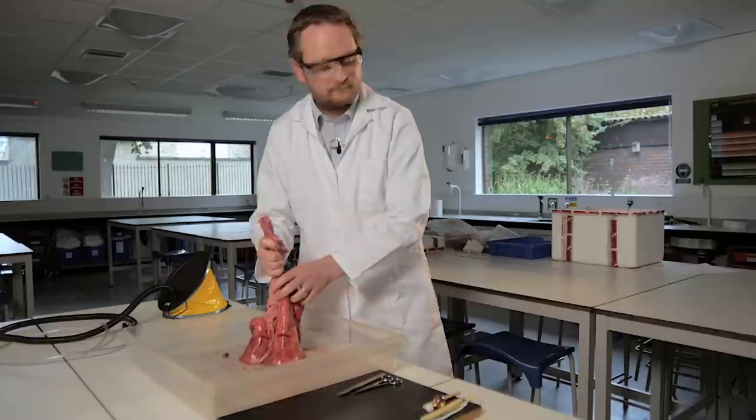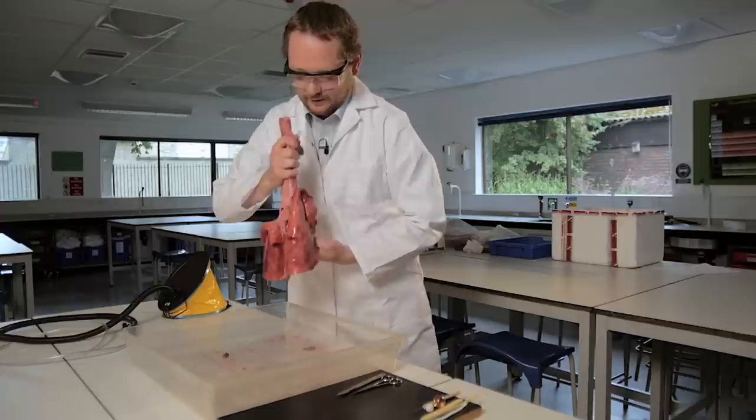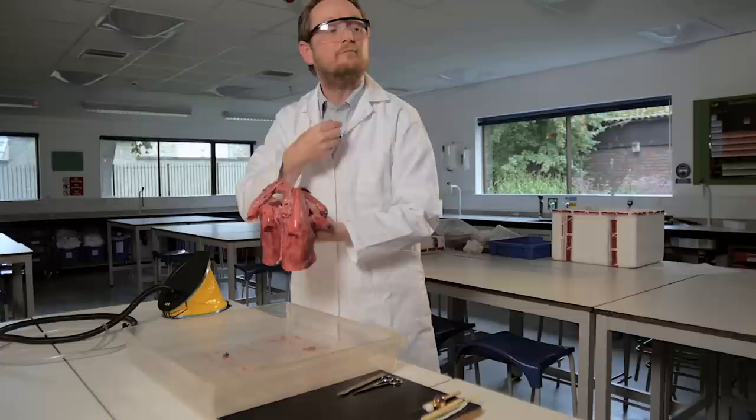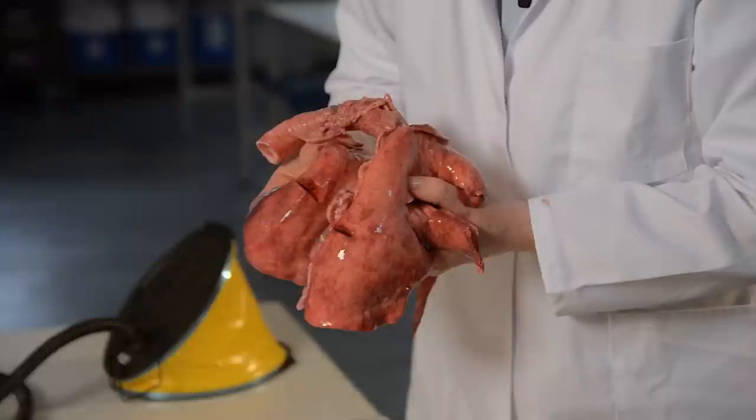The first thing I like to do with any form of dissection is relate it to the human anatomy. Students are more interested in their own bodies than they are of the internal workings of a lamb. So I'd hold it up to my body and say, here is the trachea. This is pretty much exactly like the trachea in my neck going down into my chest.